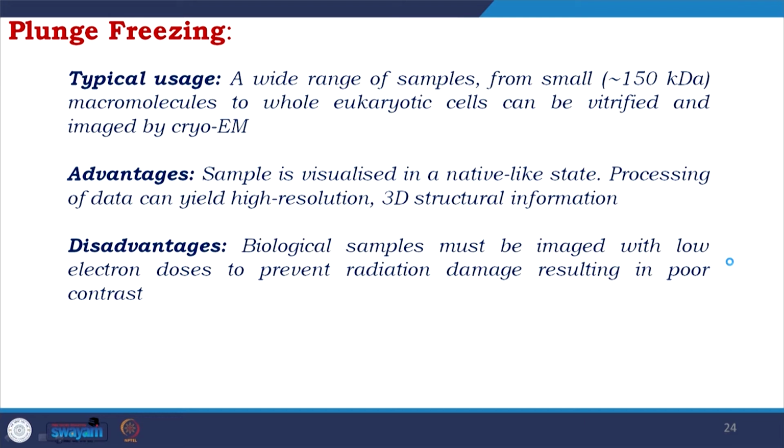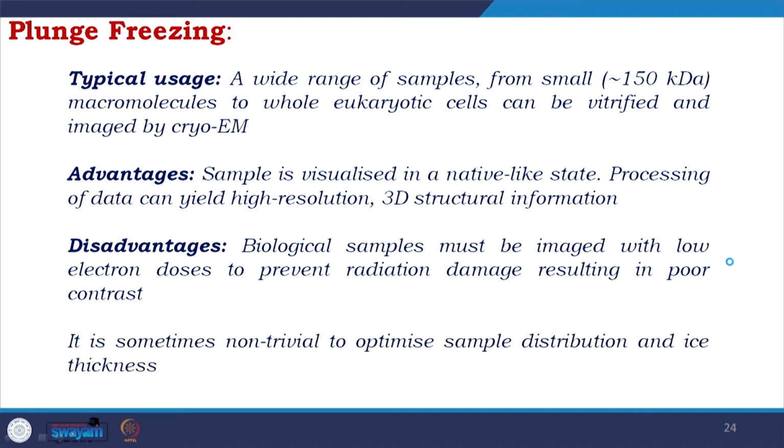Disadvantage: biological samples must be imaged with low electron doses to prevent radiation damage, resulting in poor contrast. It is sometimes non-trivial to optimize sample distribution and ice thickness.